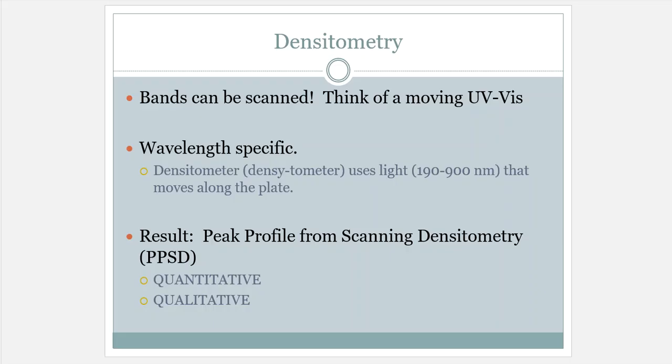This is the concept that we can quantify. We can quantify numbers, we can build calibration curves, we can make standards, and we can get linear lines. Absolutely, that's what densitometry is all about. When I apply a band onto a plate, if it is very weak, it will have a very light signal. If it's a little stronger, it will have a darker signal. Then if it's a little stronger, it will be much thicker, much deeper, much darker. And then I can see that on my plate.